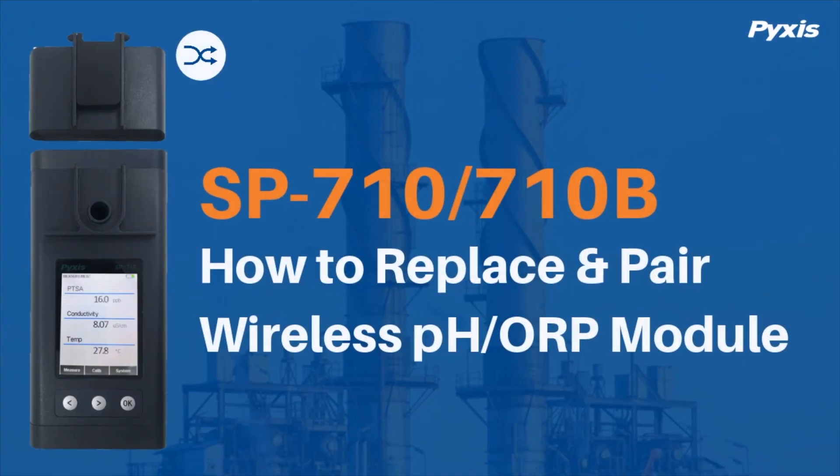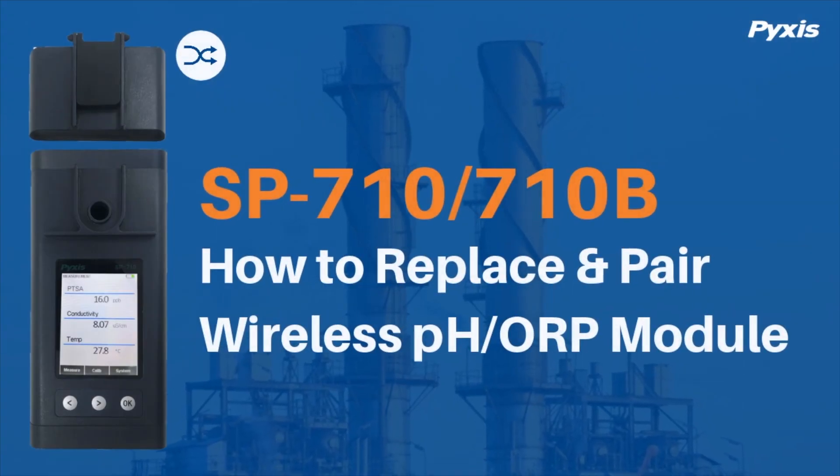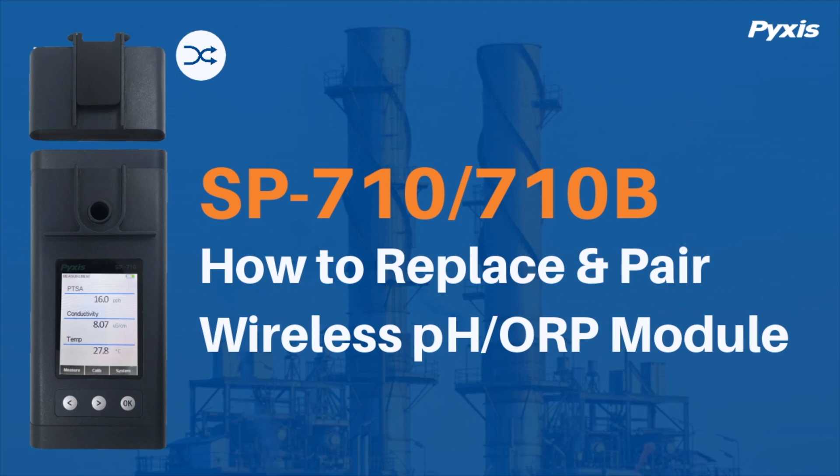This video demonstrates how to replace and pair a Pyxis wireless PHORP module for your SP710 or 710B handheld multimeter.